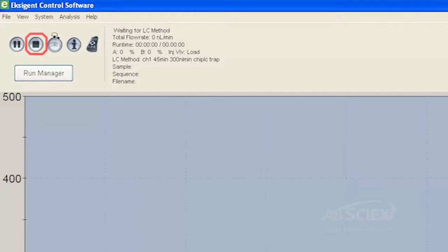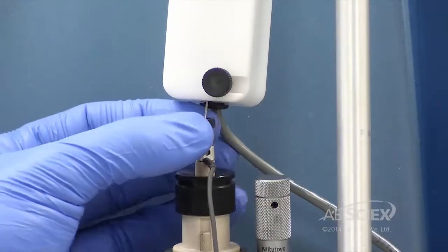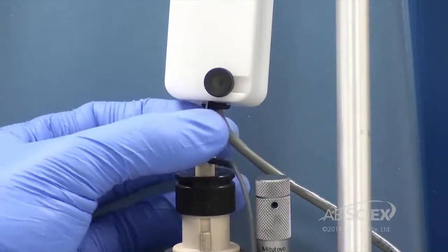Stop any flow in the Exigent software. Disconnect the tubing from the electrode and remove the column heater.